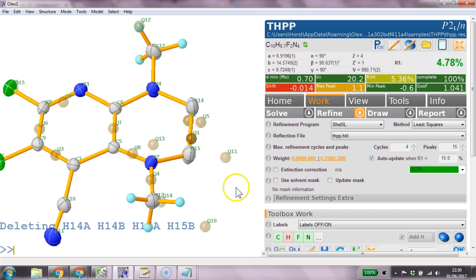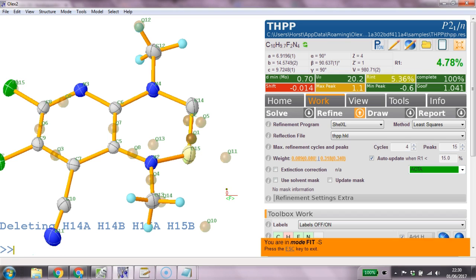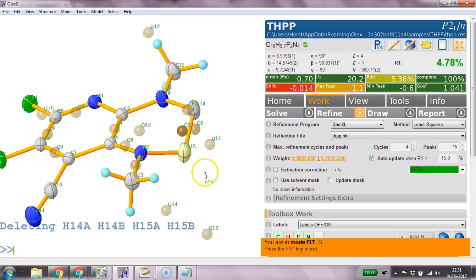And I'm going to use mode split. So I click on this one here and type mode split except that's not what it is. It's mode fit minus S for split. So this allows me to split this atom by shifting it with the mouse.